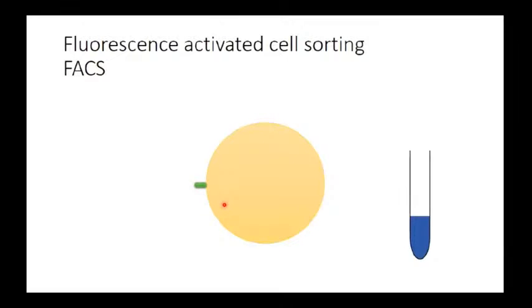And then I want to separate this heterogeneous mixture into two groups of cells: the cells who are expressing the protein and the cells who are not. To do this, first of all, I have to design a specific antibody for this protein. This antibody is specific to the protein of my interest. There are companies who design specific antibodies for particular proteins. Then I have to label this antibody with a specific fluorophore.